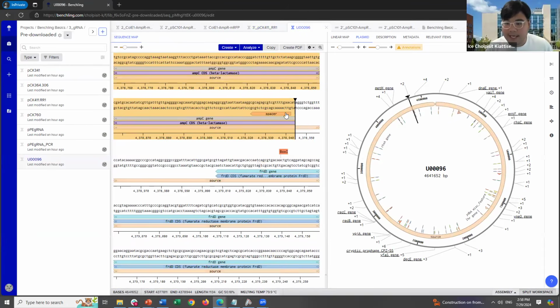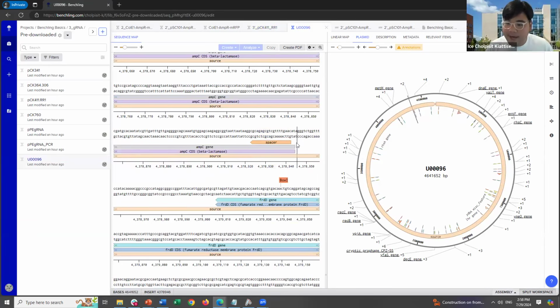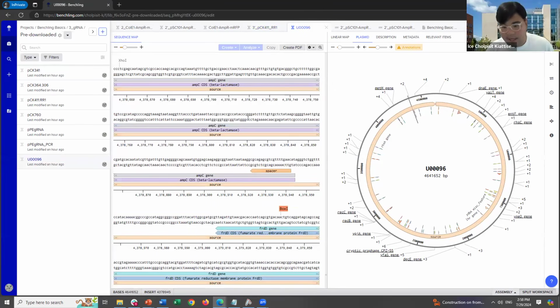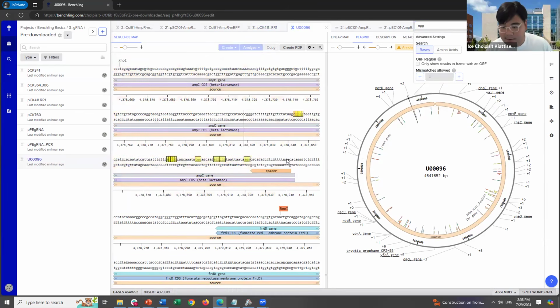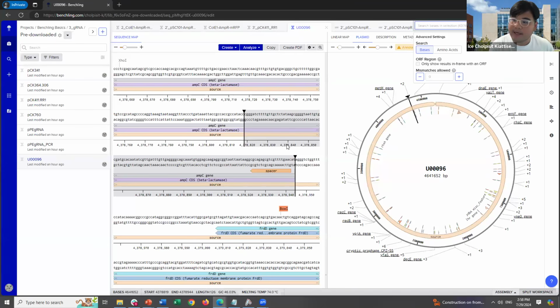And when you do the design for the CRISPR knockout or CRISPR interference or whatever, the CRISPR system actually requires the PAM site, right? So if you search for NGG, you can just highlight this part and hit Control F, similar to how you use Microsoft Word, and hit NGG. There'll be some NGG sequence that shows up. And this is the piece of DNA that can work as your PAM, or protospacer adjacent motif. You need the spacer sequence to be right next to this PAM.